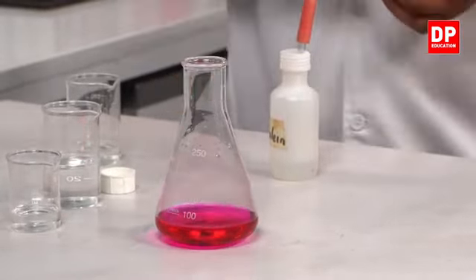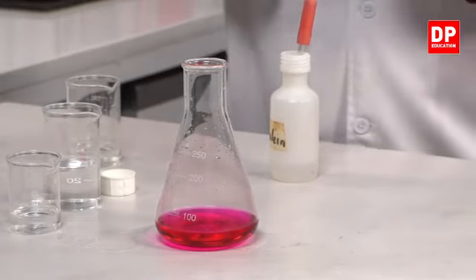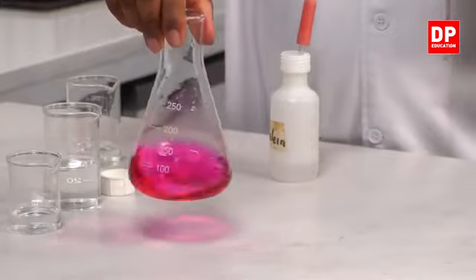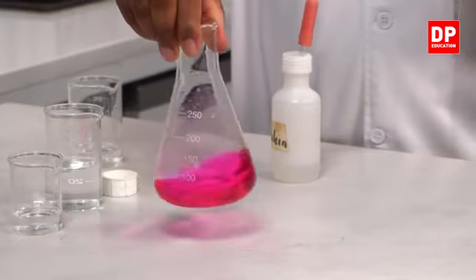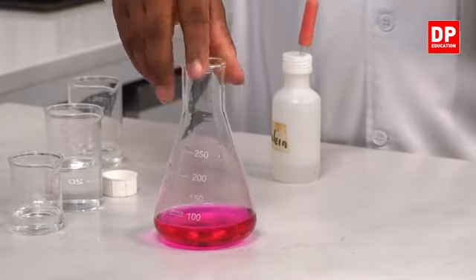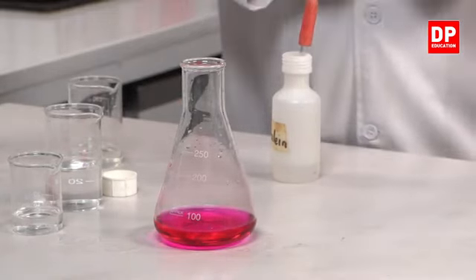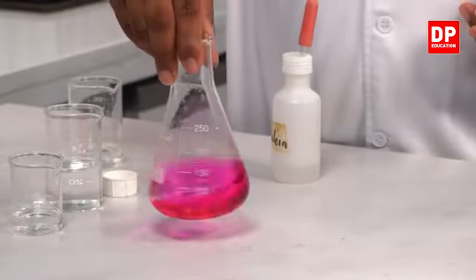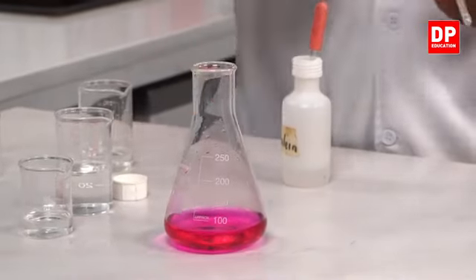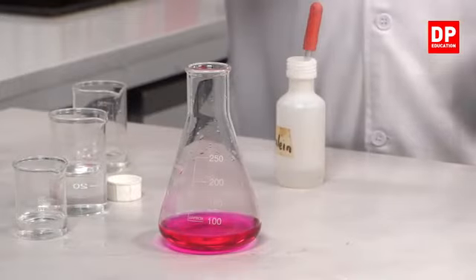Earlier it was a dark pink color, but now gradually the color is decreasing. So we'll add drop by drop. See, the color is gradually decreasing. We'll add another drop. See, earlier it had a good pink color, but now the color has reduced somewhat.